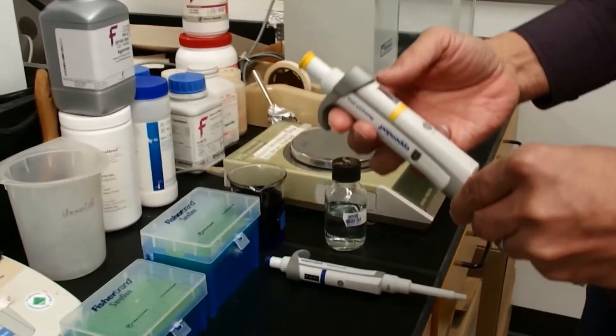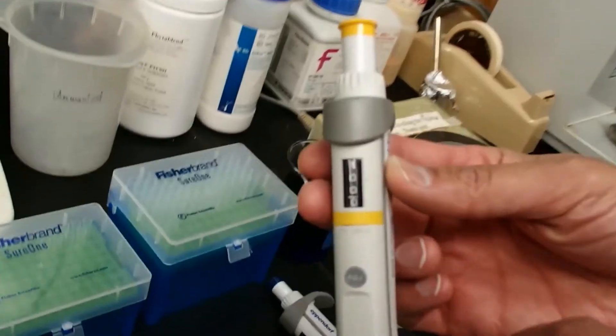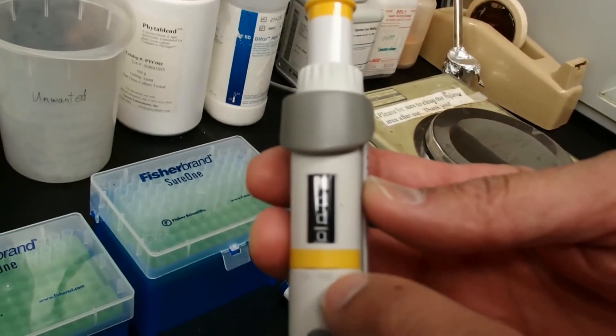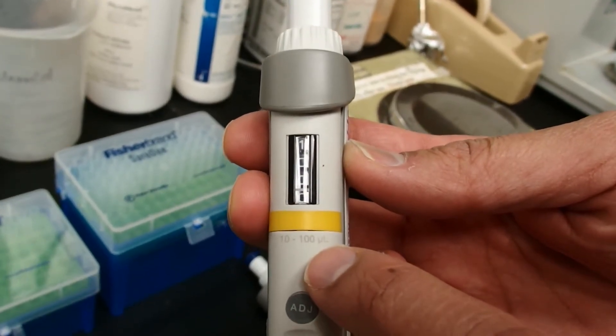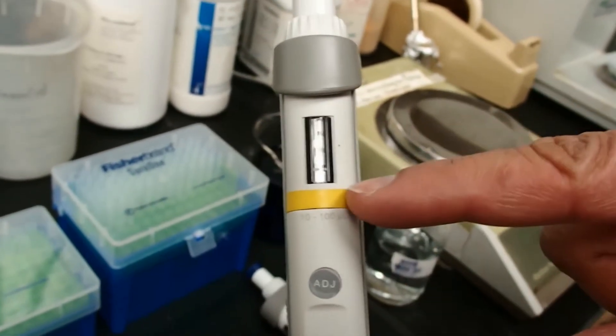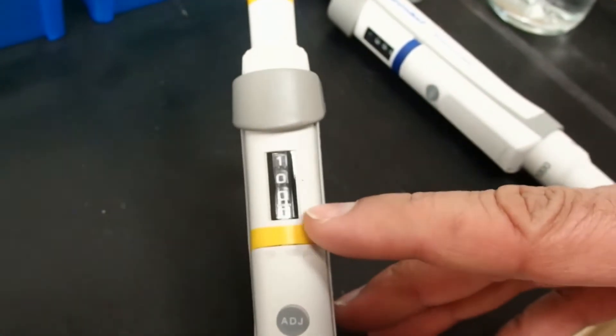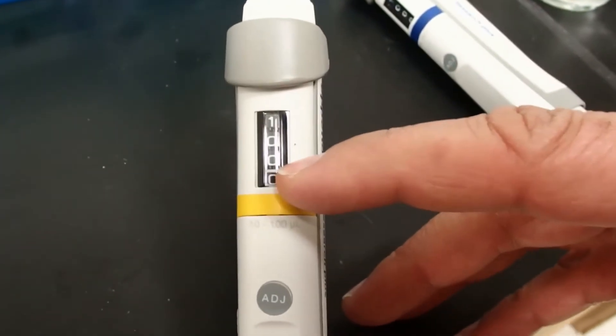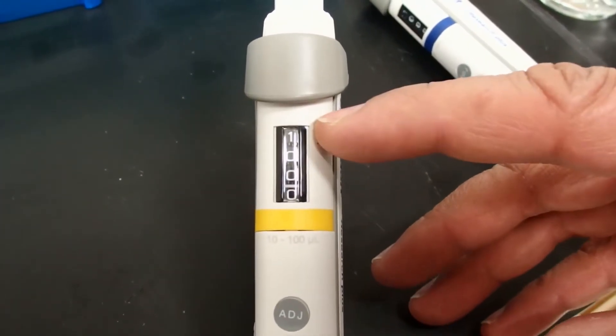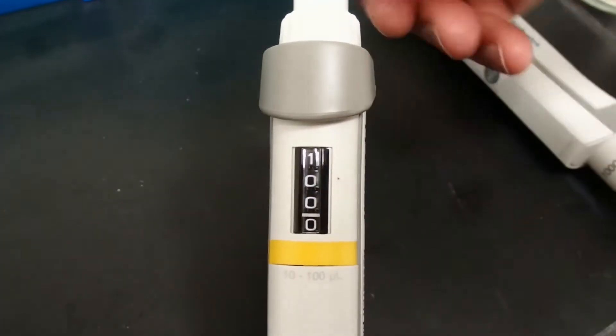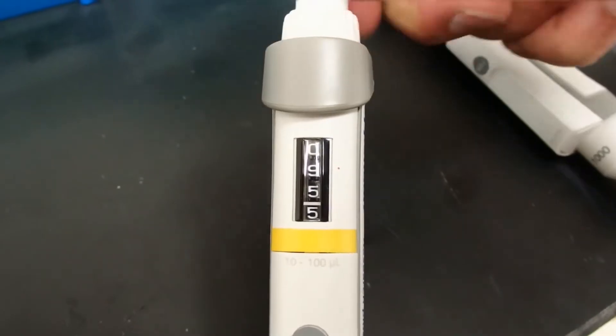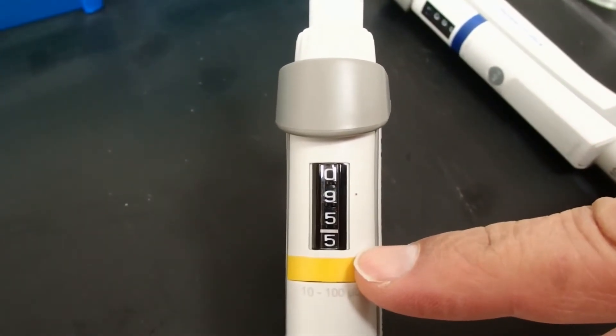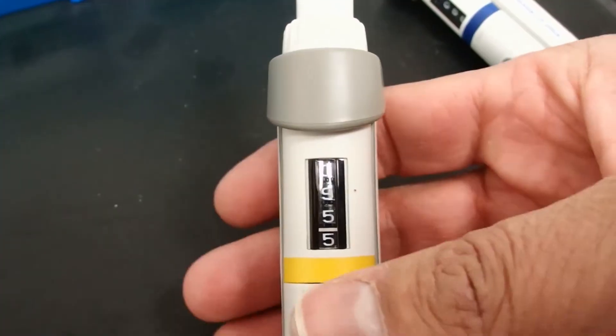The other pipettes have a different range. The P100 has a range of 10 to 100 microliters. They're written on them. Do not dial outside of that range. You'll notice that the P100 has a line right here. That line is basically like the decimal point. Right now, this reads 100.0. If I adjust it, you can see I can make it 95.5 microliters. Otherwise, the operation is pretty much the same.